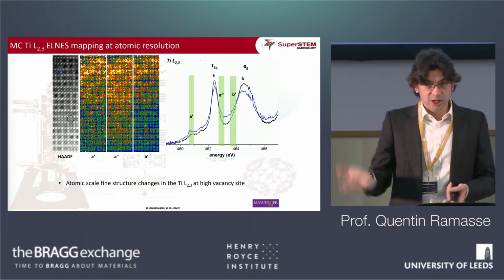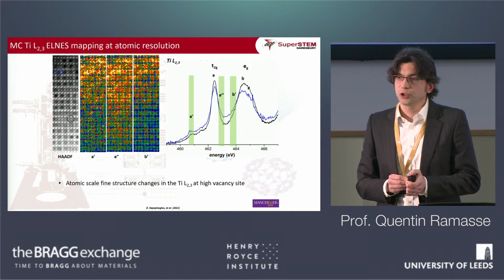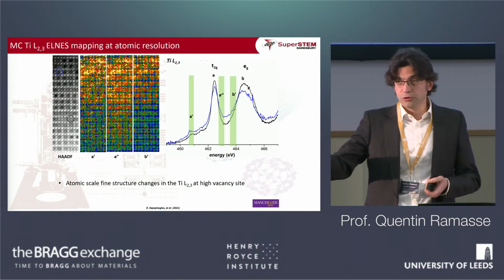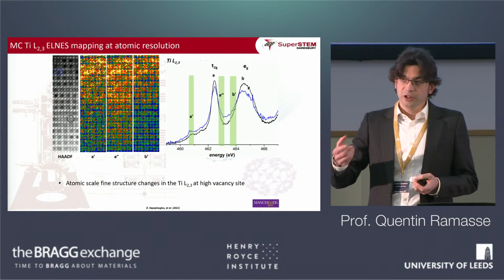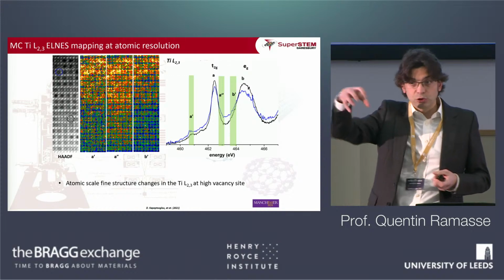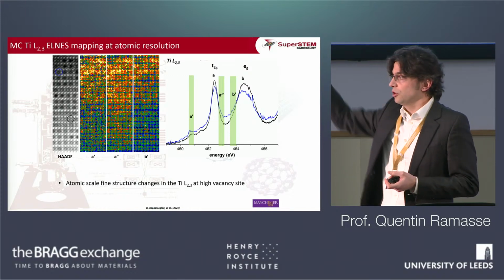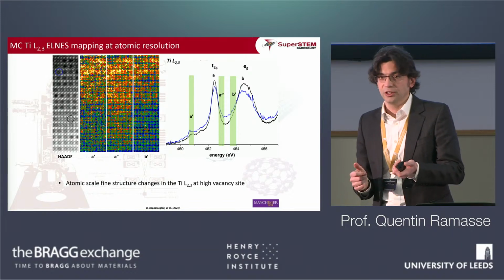So one aspect of that is very similar to X-ray absorption spectroscopy. If an electron going through the material loses a certain amount of energy, that might correspond to the amount of energy that is necessary to take one of the core electrons of the material out of its position into the continuum. This is specific to the type of species that you have.